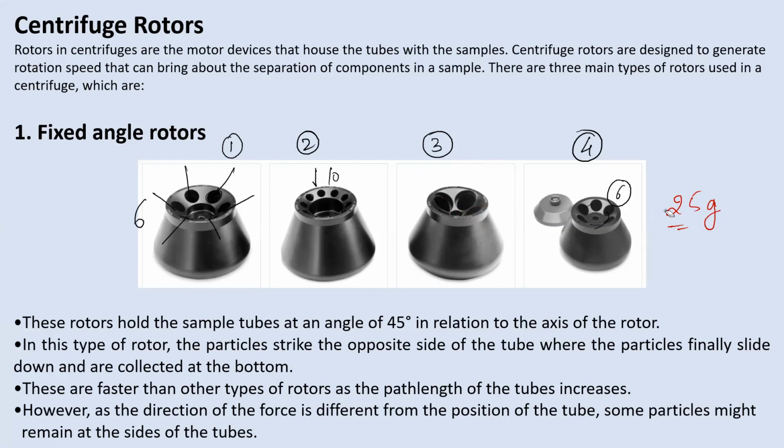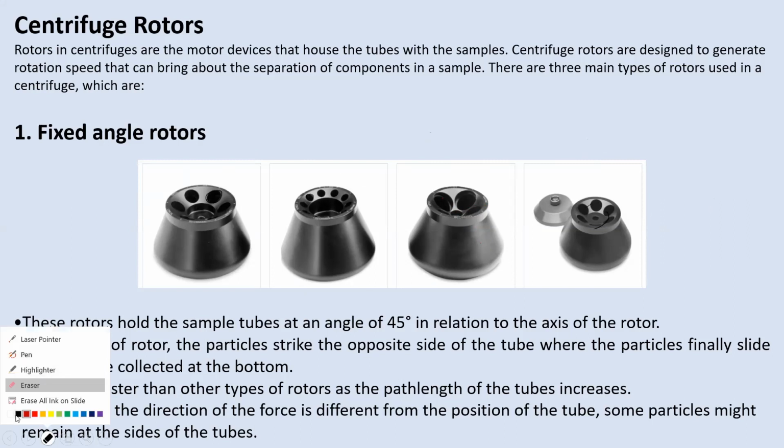and you can take two centrifuge tubes. But suppose you do not have that much crude extract to separate, and you are just working on 20 to 25 ml, so you do not have so much medium to use as a balance, then you can take water. But if you are working on a larger crude extract, then you can divide it into 2 tubes and keep both the tubes, but both the tubes should weigh equal, not unequal.